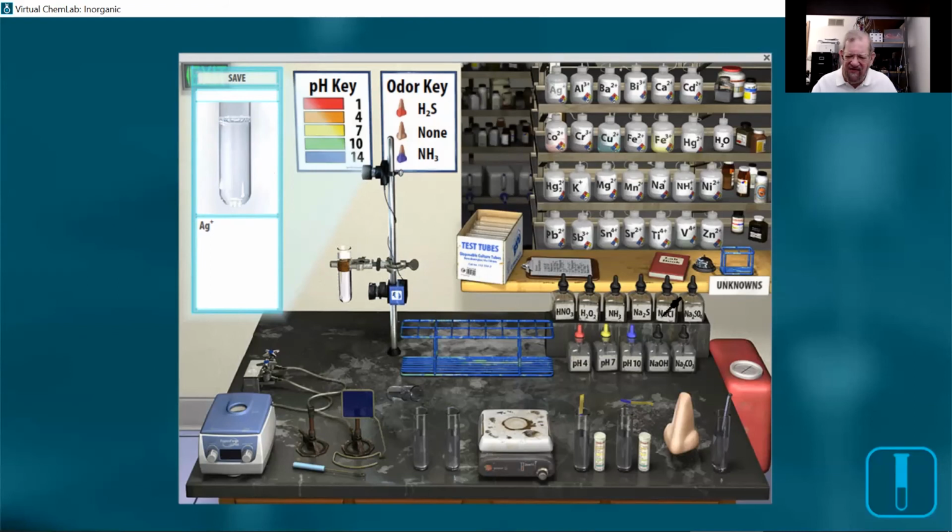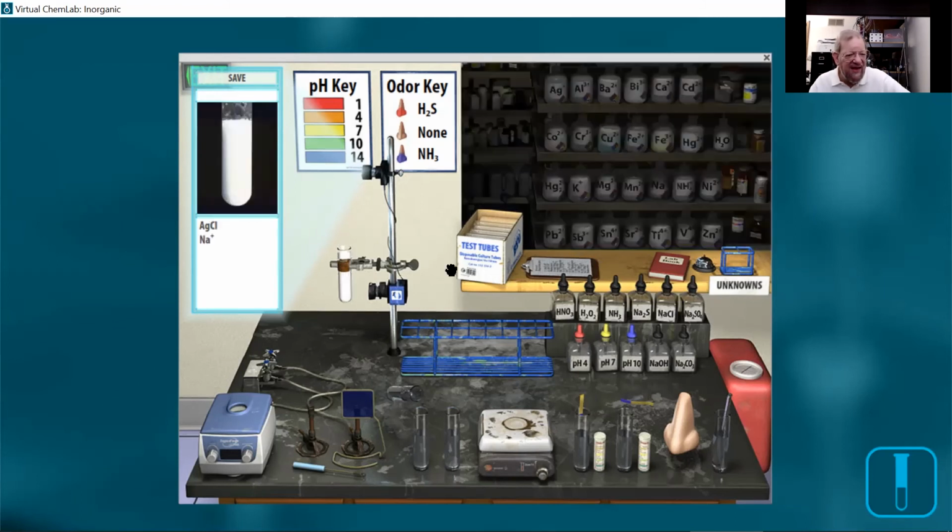Now I don't know if I have sodium chloride. And underneath here where I have my cursor, these are your second chemicals. Let's try sodium chloride. Notice when I put the cursor over the bottle, it looks like a little eyedropper. Very little, look closely. If I click on that, watch over here when I click on it. 5, 4, 3, 2, 1, click. And I've added the sodium chloride. Oh, look, there's something changed in there.